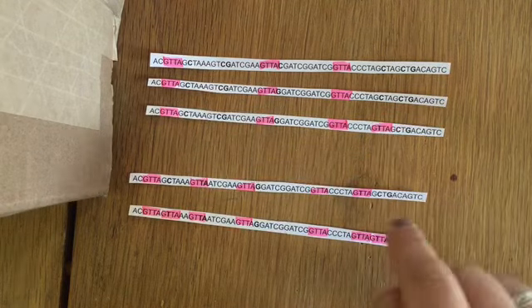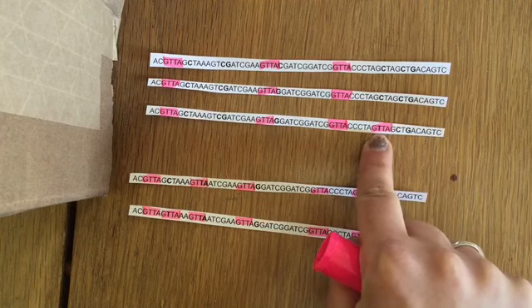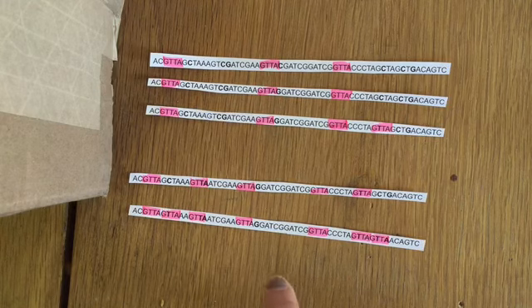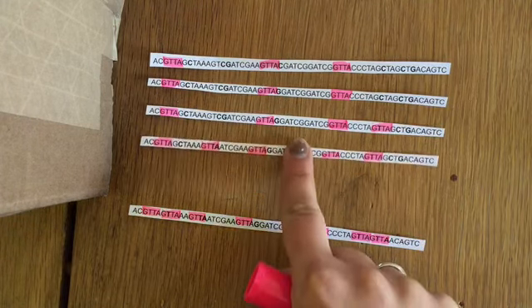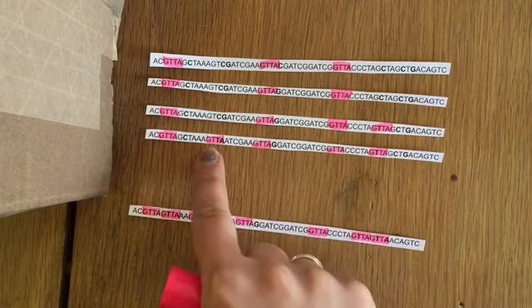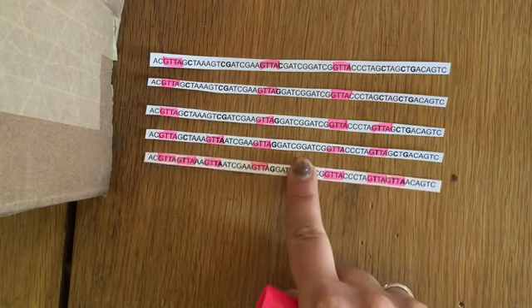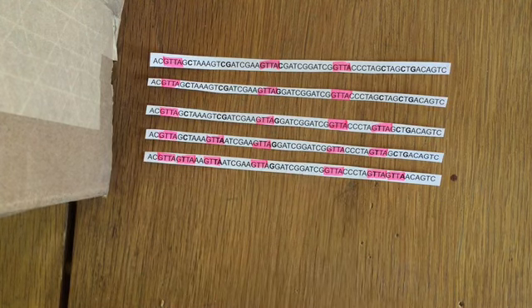Okay, and we know not all mutations are bad. So that mutation right there actually made another restriction site. So this chimp's DNA is going to get cut a little bit differently because of that mutation that just naturally happens sometimes. Between the chimp and the monkey, we see that that mutation was conserved, but we also have another mutation. And then between the chimp and the dog, we see that there's a couple more mutations that add to those restriction sites.